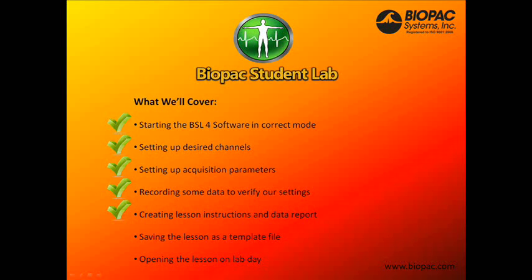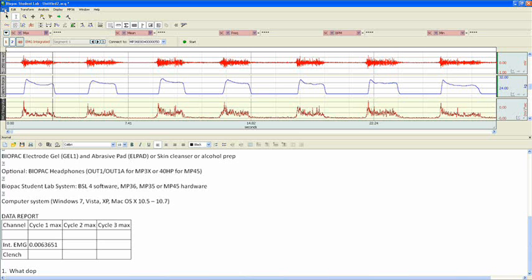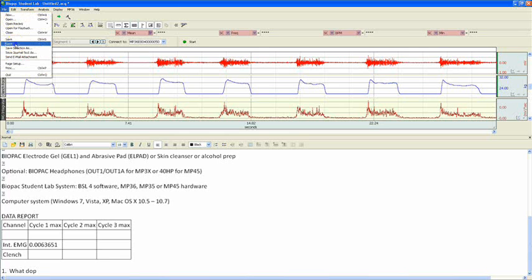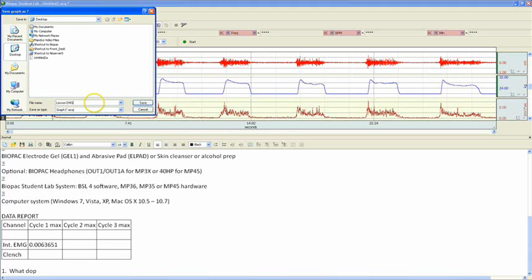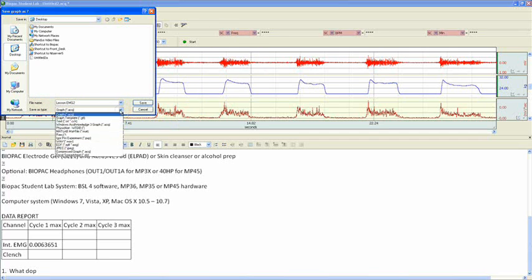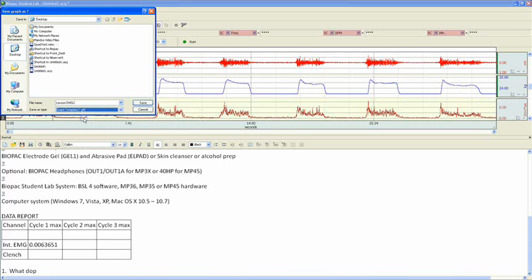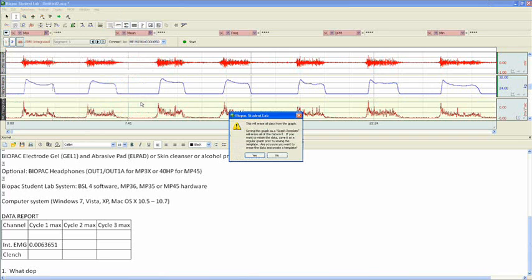To save our file as a template, we'll go to the File menu, click on Save As, choose our save location. In this case, we'll just save it to the desktop. Choose our file name. We'll call this Lesson EMG2. And then, instead of saving as a graph, which would just save the data we recorded, we're going to hit the drop-down menu and select Graph Template. And then, we click Save. Now, we're prompted with a message that says, This will erase all data from the graph.